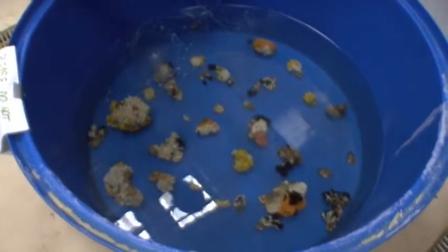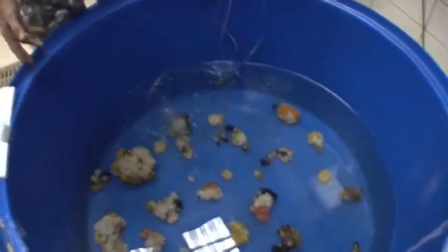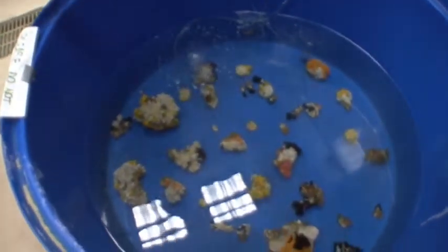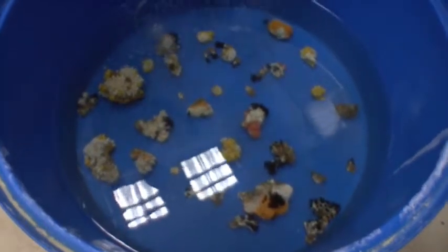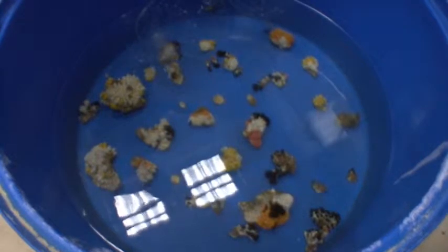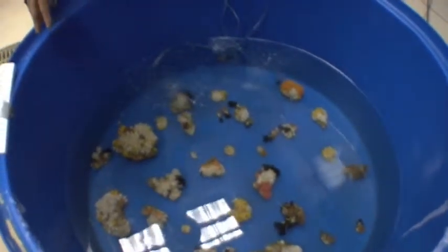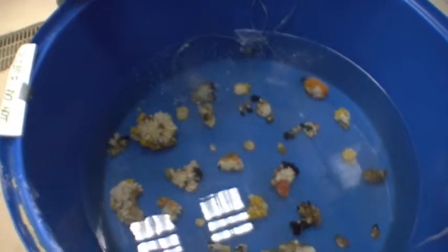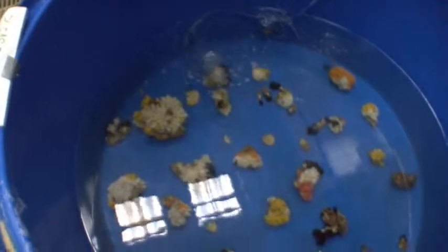And you can see the bottom of this even has some black specks on it. And those black specks, that's what we feel these corals and sponges and soft gorgonians are pushing out of their body. And as you see, maybe not 100% of the tissue made it, but at least we were able to save some of the tissue and to prove that these things can depurate themselves.